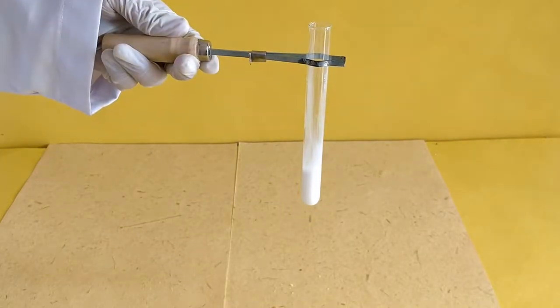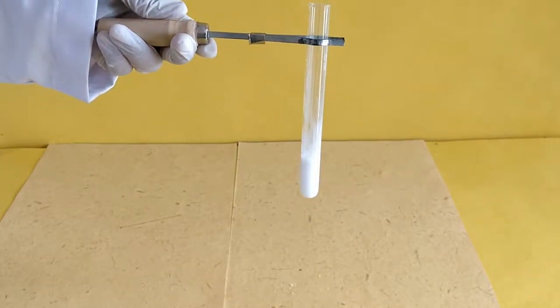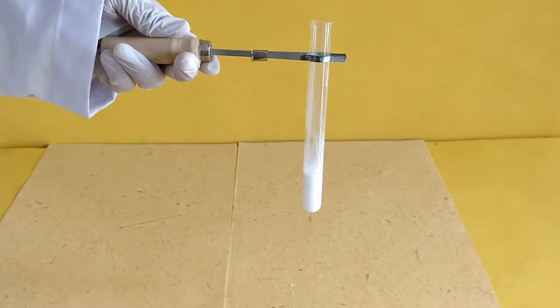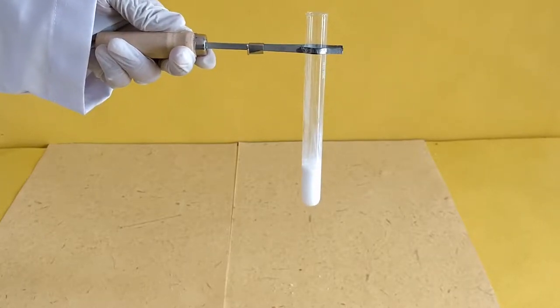You will observe that a white precipitate is formed immediately in the test tube. This is barium sulphate.